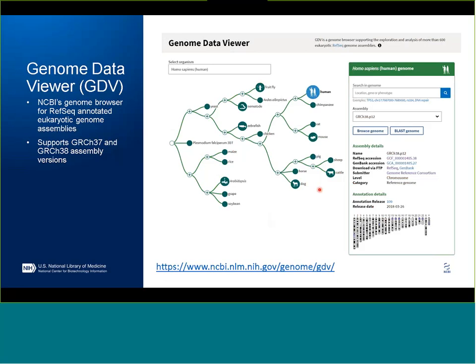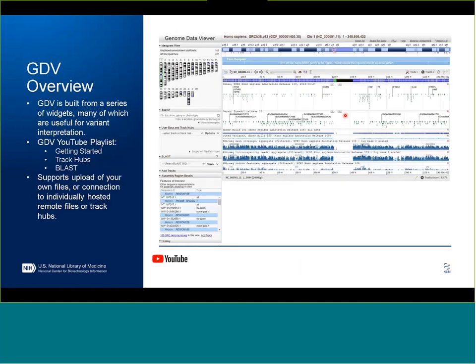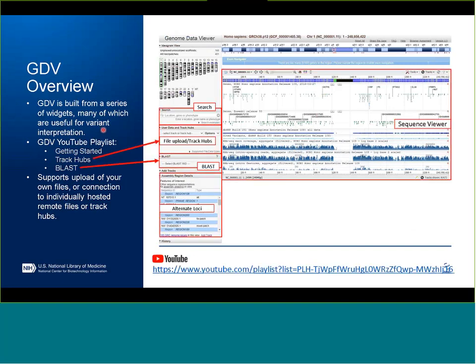With that, I'm going to change hats and talk about the Genome Data Viewer, or GDV, which is the NCBI Genome Browser. I'm going to talk about it as a tool you can use to evaluate data in the context of GRC H38. From our landing page, you can select both your organism and assembly of interest. We support more than 600 different assemblies from a wide variety of taxa right now. For human, we do have support for both 37 and 38. GDV is built from a series of widgets, many of which you can use for variant interpretation, and I'm going to highlight a few of them in the next couple of minutes.